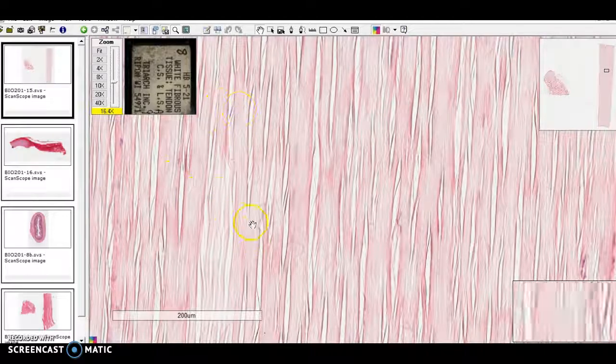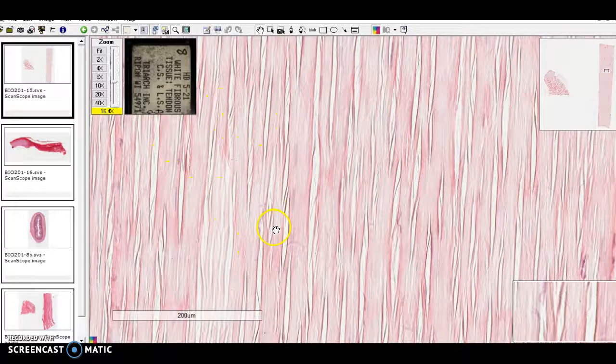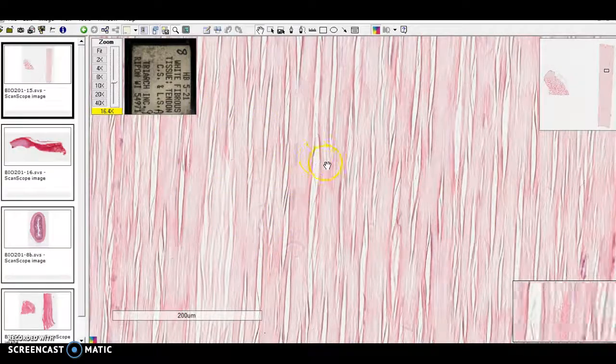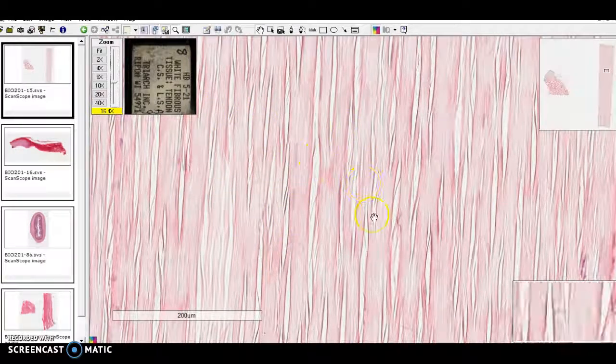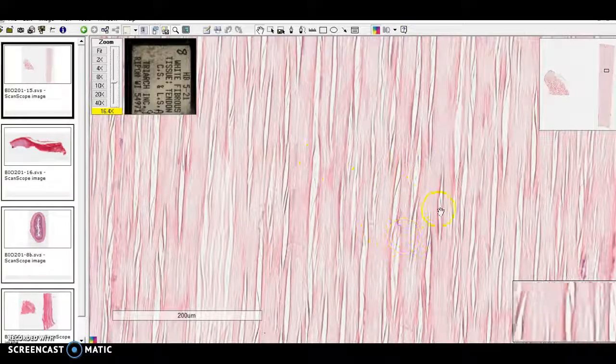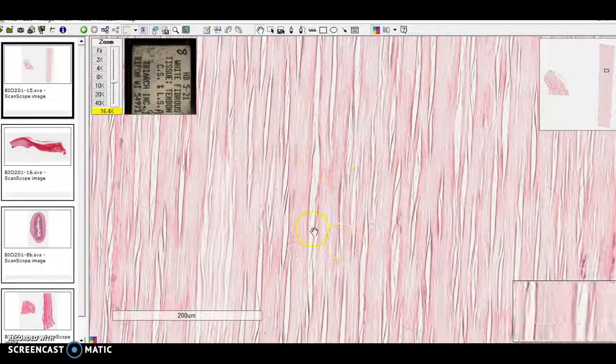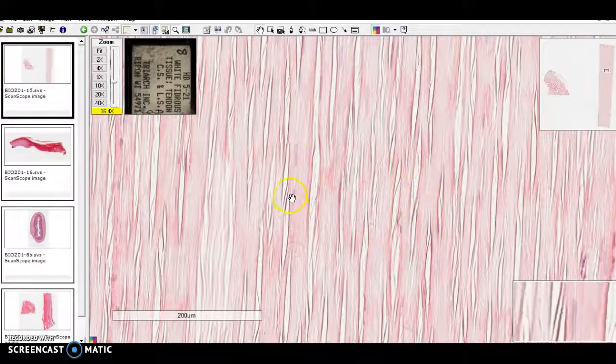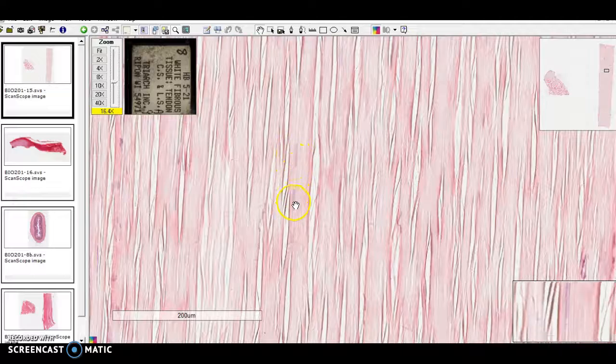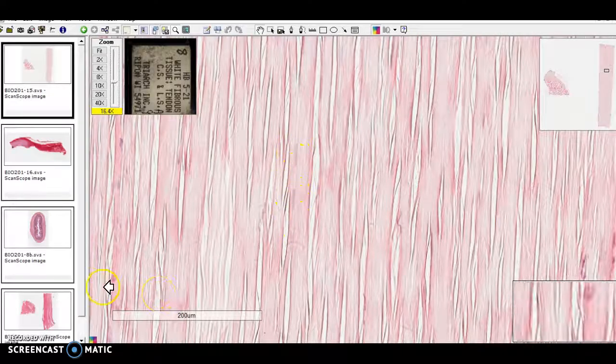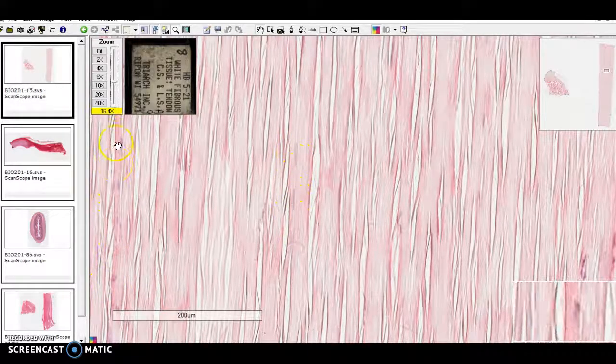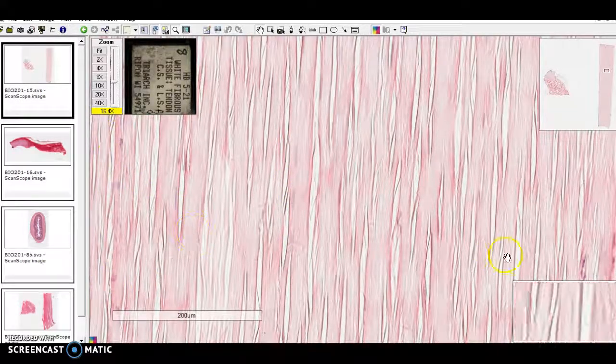These fibers, you can see them where they've started to pull apart a little bit, you can see all these fibers. You can see very faint nuclei of your fibroblasts running along here.